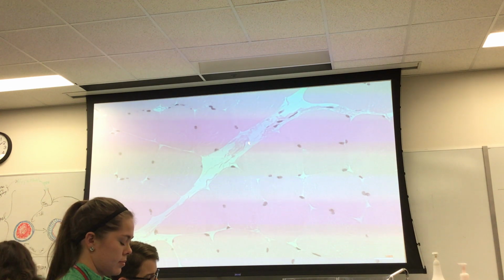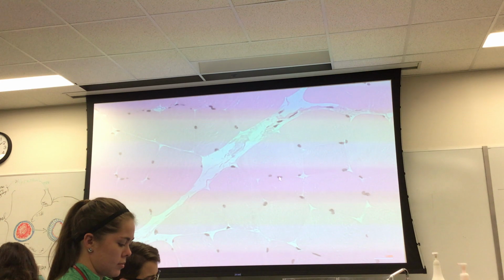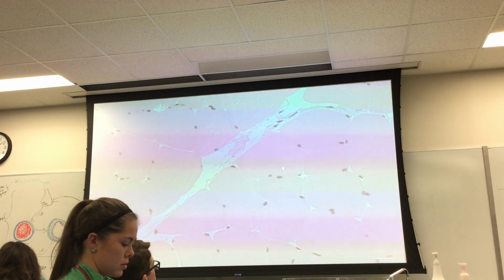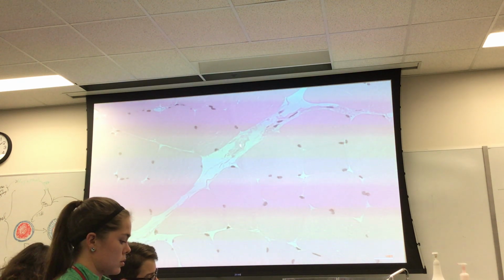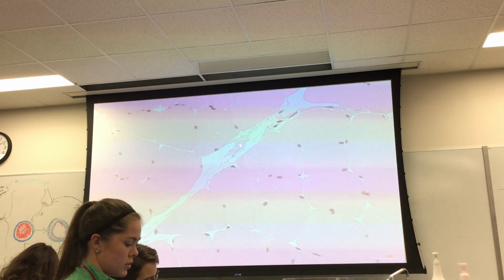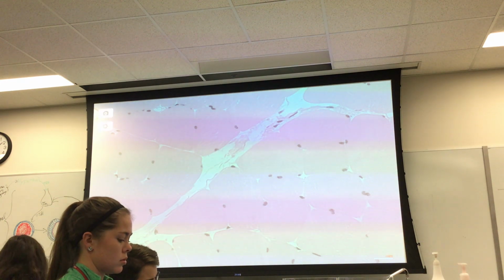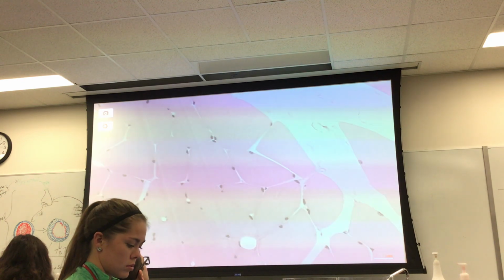What do you call this as a structure? Perimysium. Why? Because it's got muscle on both sides. If it was on the outside, you'd call it an epimysium. And now, by definition, what tissue type comprises the perimysium? Dense, irregular. I don't care what it looks like. By definition, it's dense, irregular. Okay, I digress.